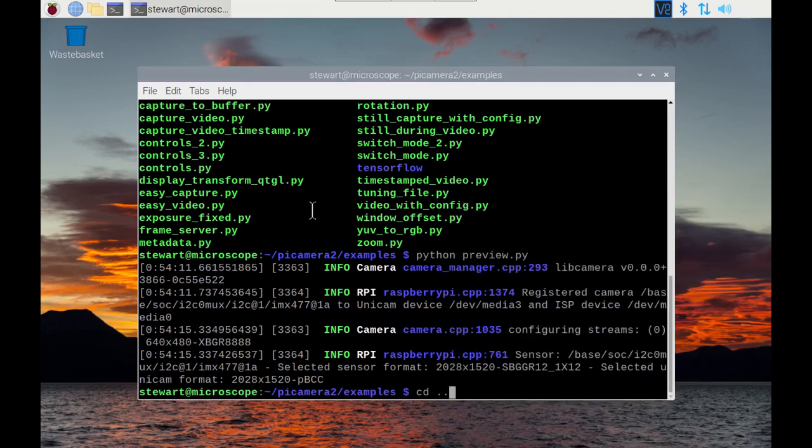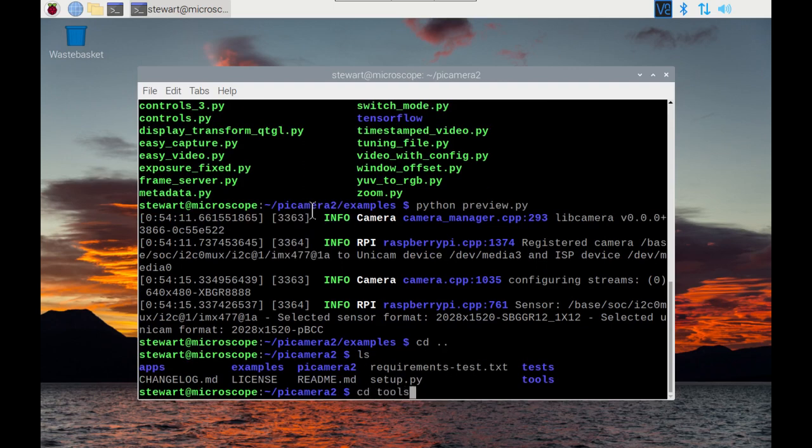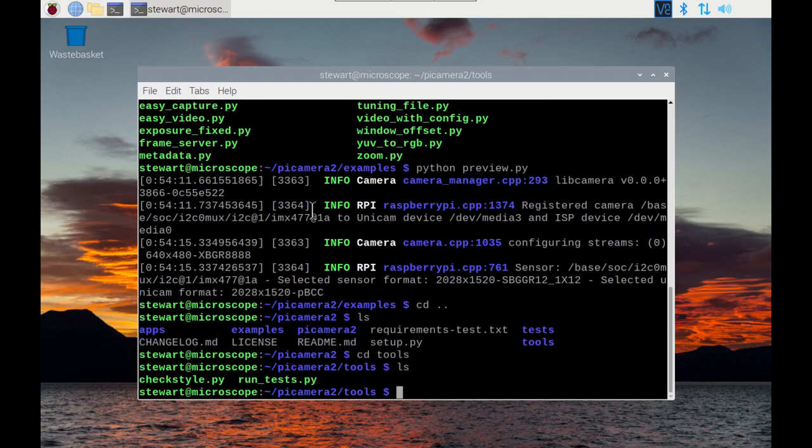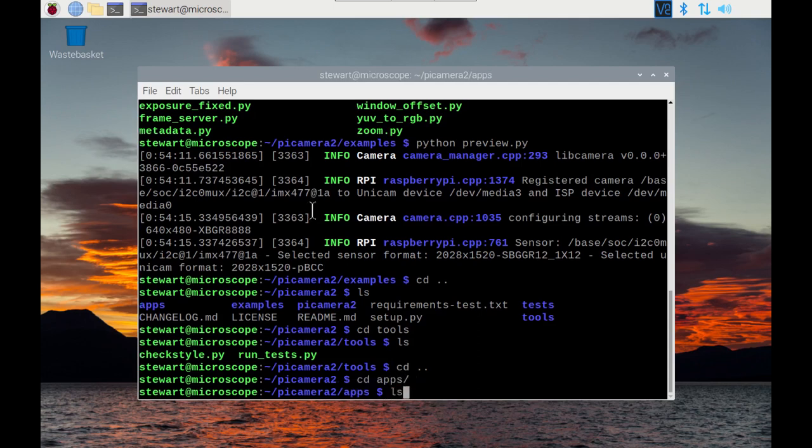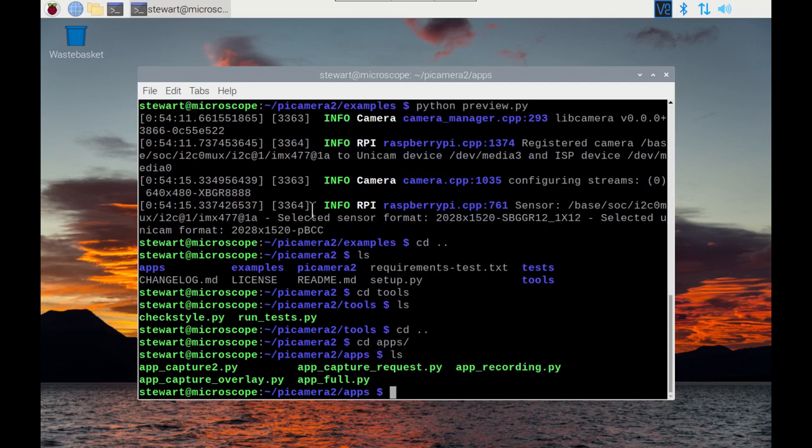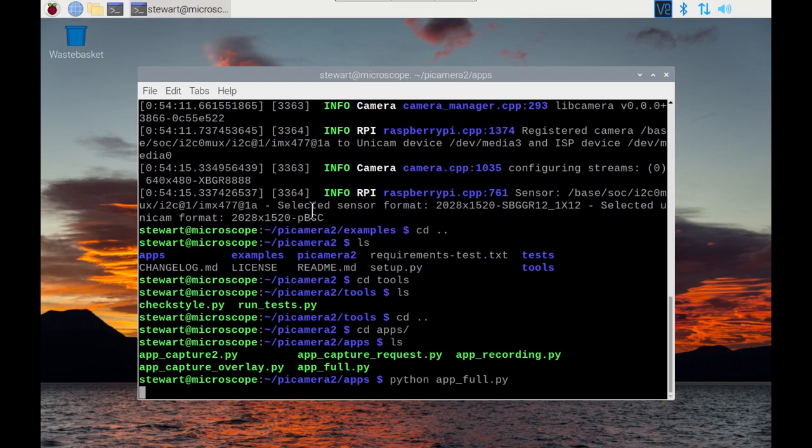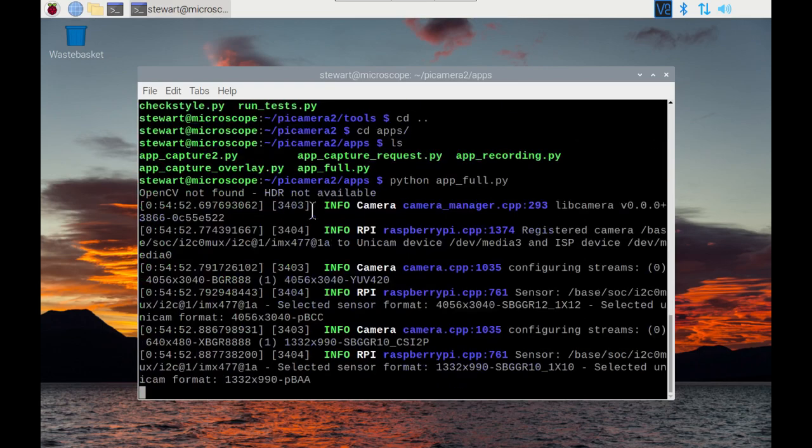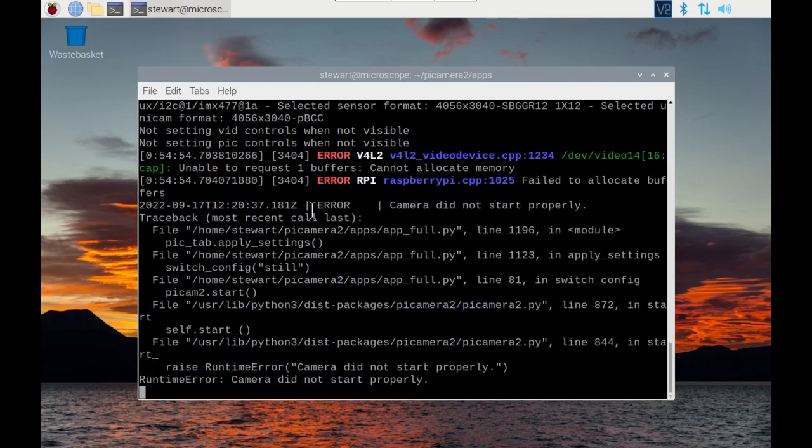There's also a tools folder. In fact, there are some tools which has some tests and things, but it's the apps folder that I wanted. This is going to give you an application that can be used to control the camera.